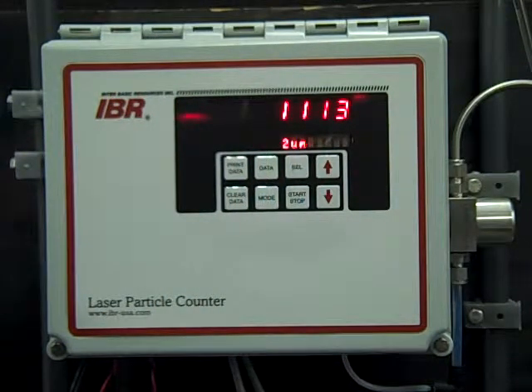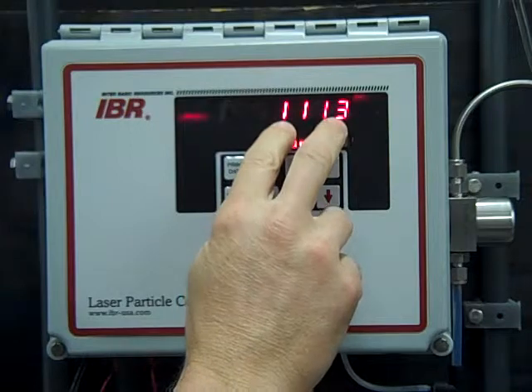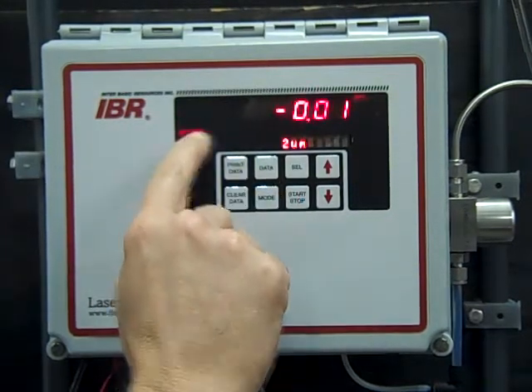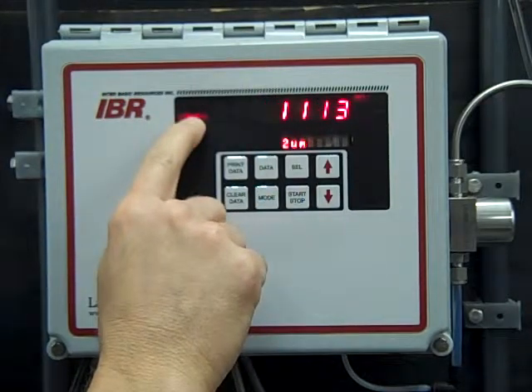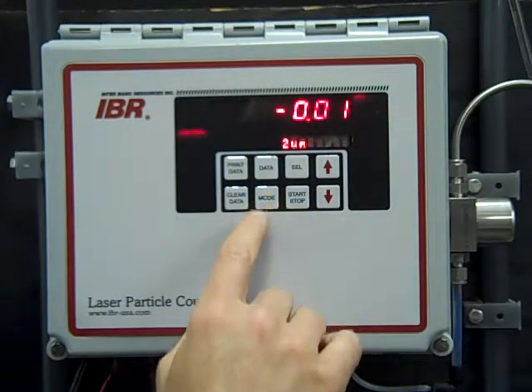Now, there's 2 formats. The data can be displayed in 2 formats: total counts and counts per ml. Total counts, counts per ml. This is log removal. It doesn't apply, not necessary.